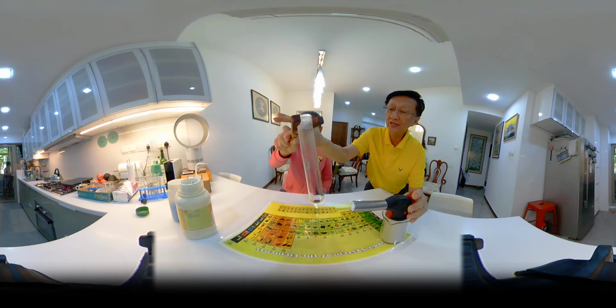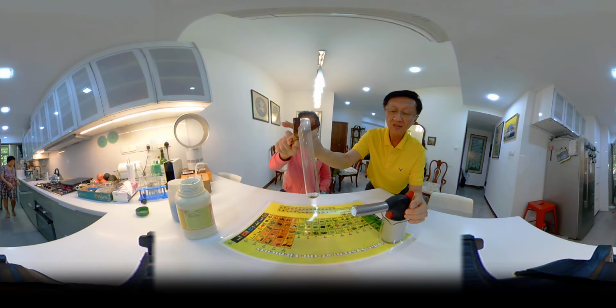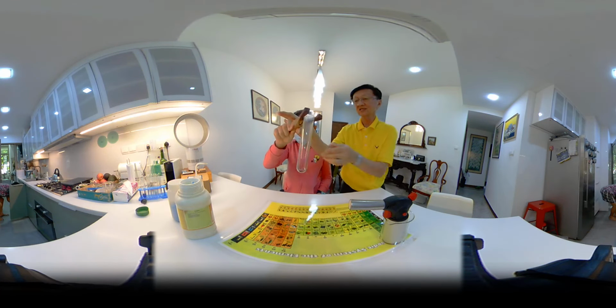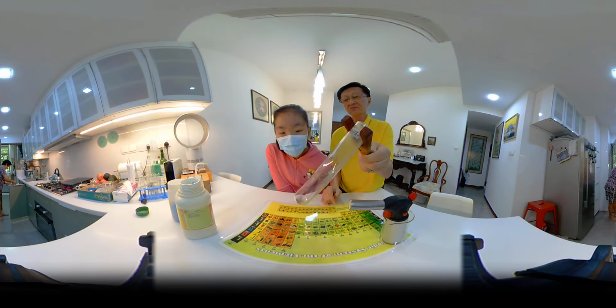So the green nickel 2 carbonate has become black, and now the amount of solid seems to be less, right? Just now was a lot of green, now it seems to be less.